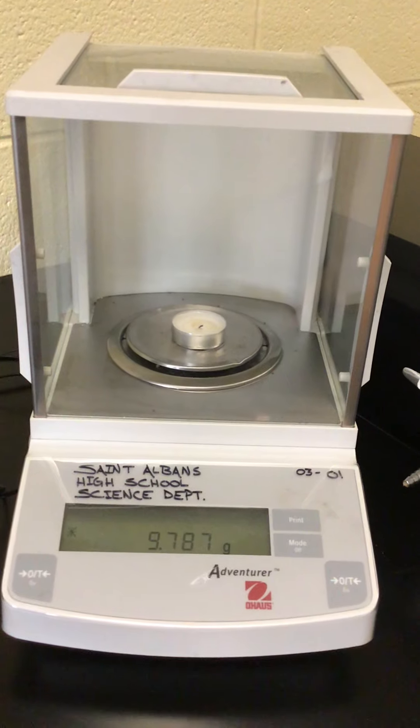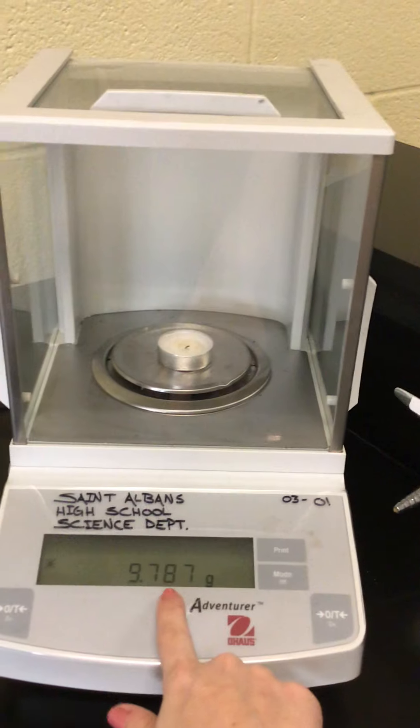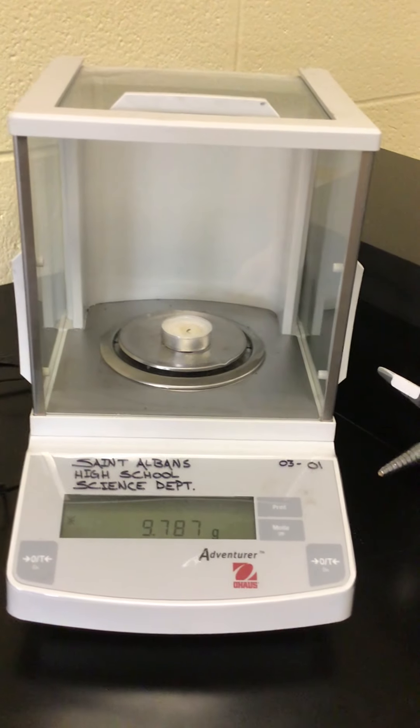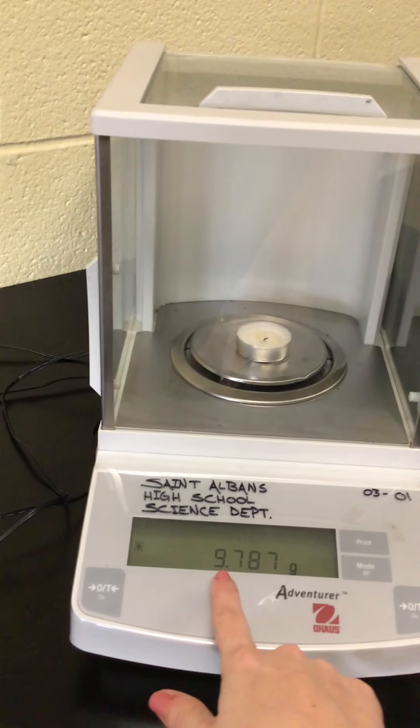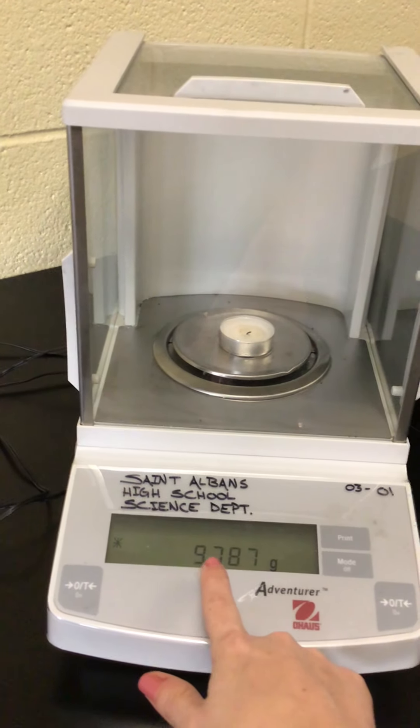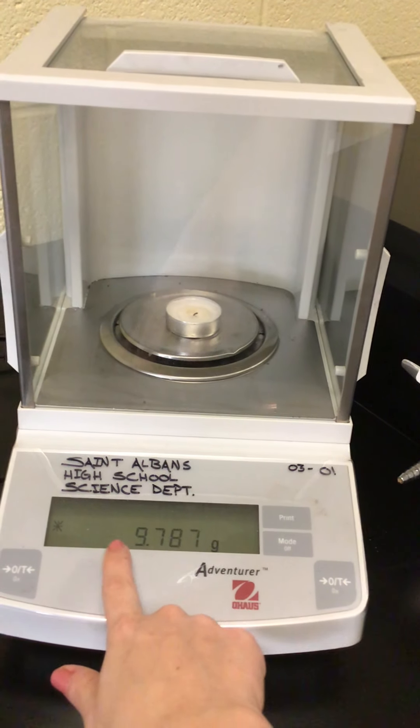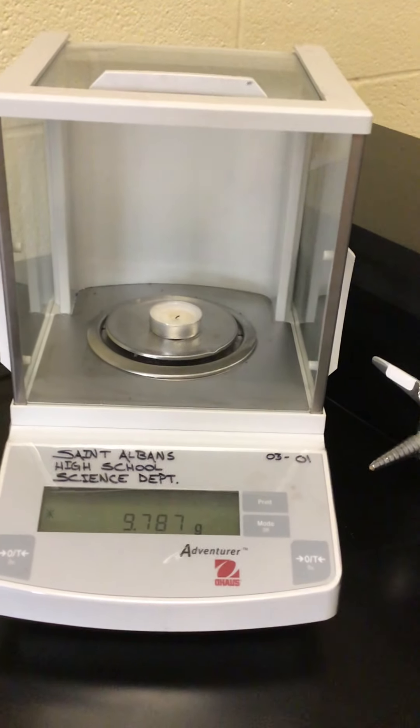So for this one it would probably be best to not use it for measurements that require more specific than a hundredth of a gram or this decimal place right here. So if I were to measure this out to the nearest hundredth of a gram it would be 9.7 and then this 8 would round up to a 9 so it would be 9.79 grams that I would record on my paper.